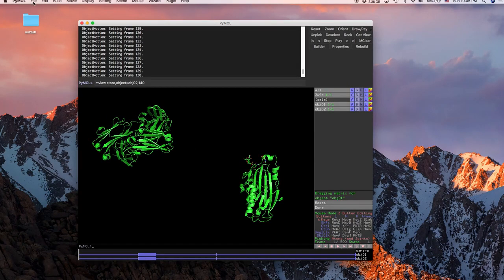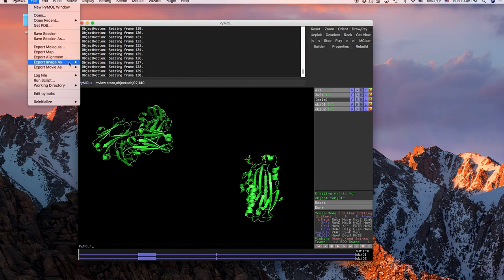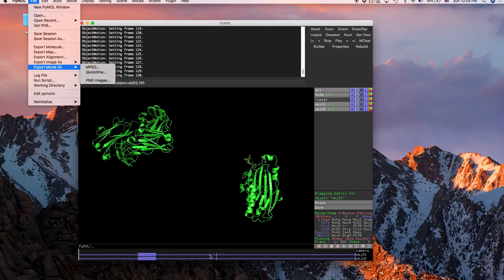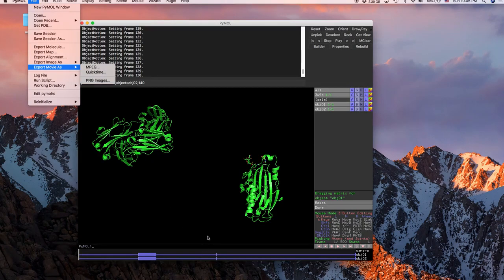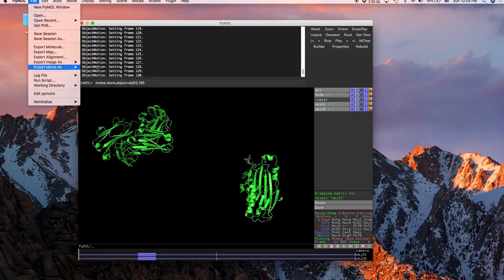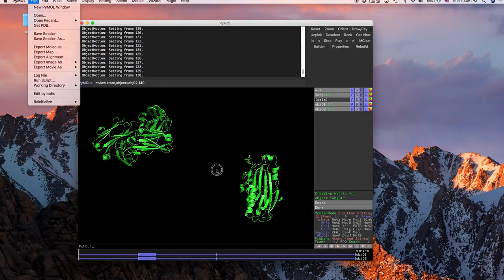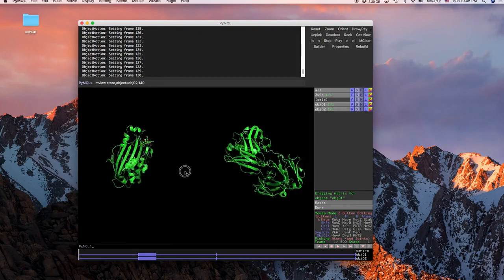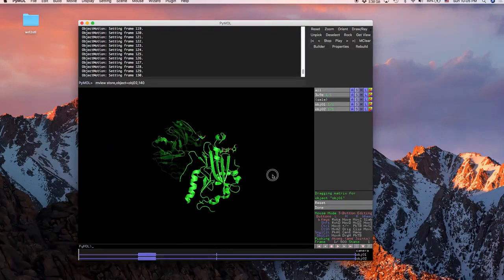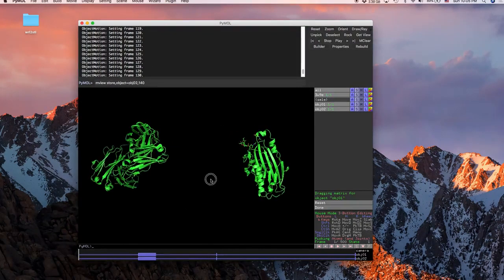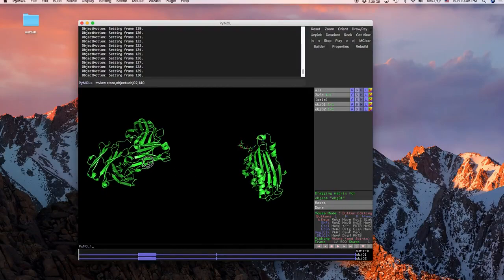And then if you want to make this into an actual video, we'll just do export movie as and then just save it as an MPEG or QuickTime, whatever you have. I'm on a Mac, and then it'll just go through all of these and it'll just save it to wherever you have your default location. If you have any questions again with any of the other videos or this one, just let me know.